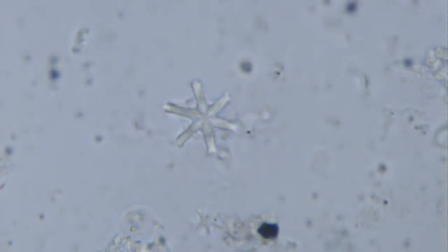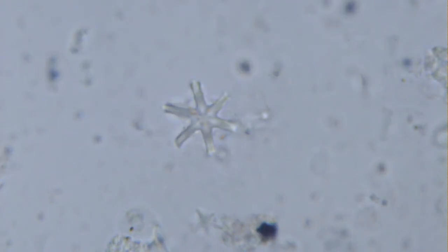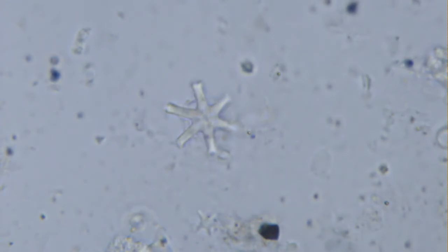V units means crystallites of calcite in which the optical axis is vertical, that is, in the same direction as light propagates. There are also some calcareous nanofossils exclusively composed of these V units. What happens in these cases?